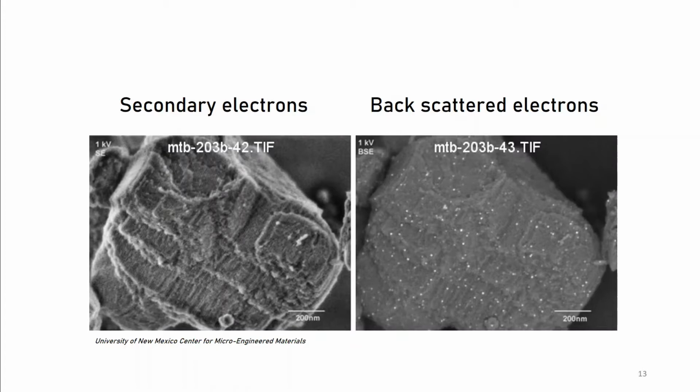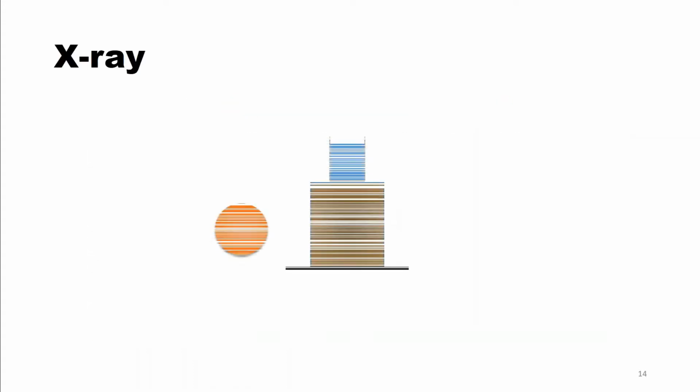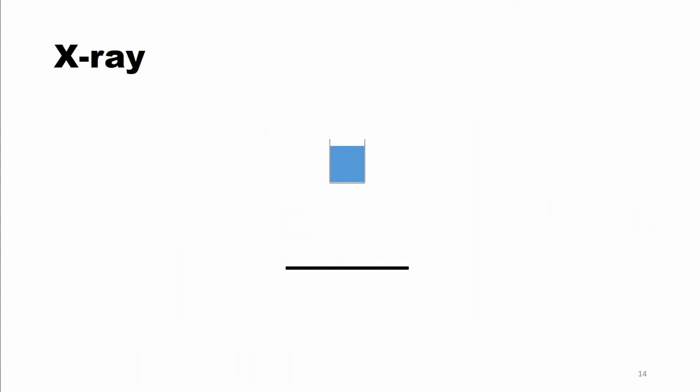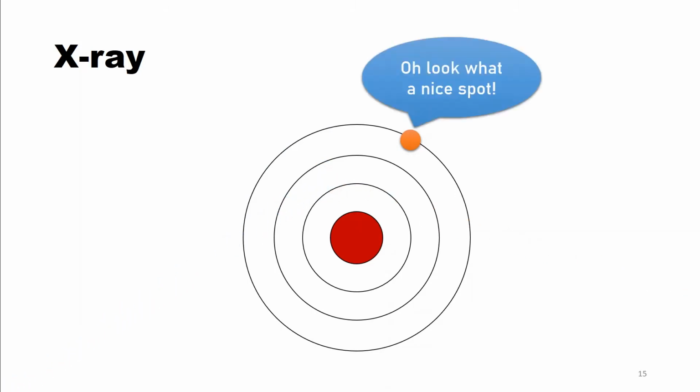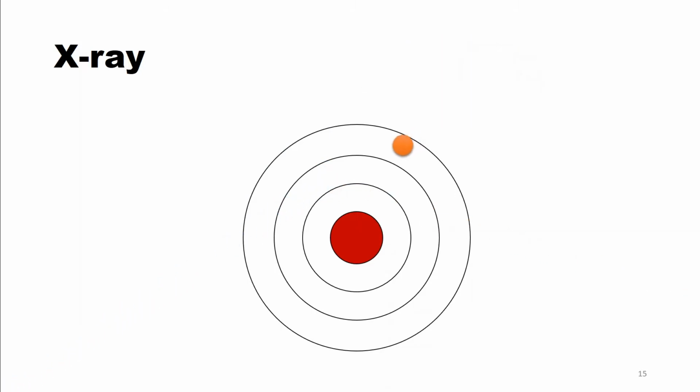To find out the identity of these two different materials, we need to take a look at the characteristic X-ray spectrum. I hope you still remember the analogy about shooting your friend into the stomach while playing pool. Now, what actually happens is that a primary electron hits any electron in the atom which gets released. What remains is a vacant spot that can be filled by an electron from a higher energy level.